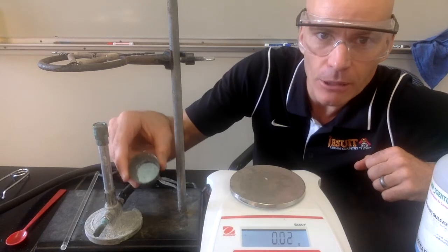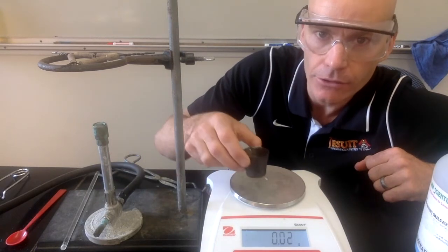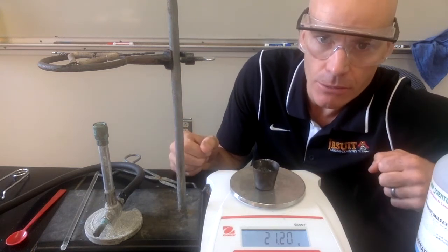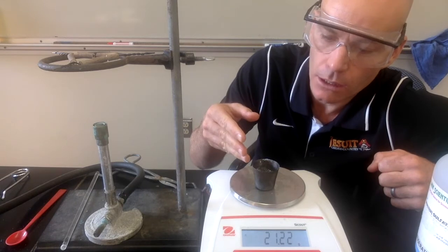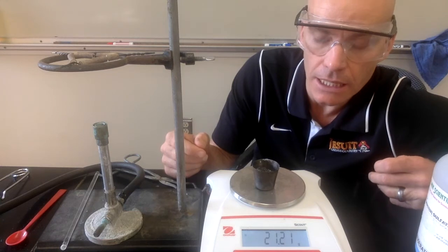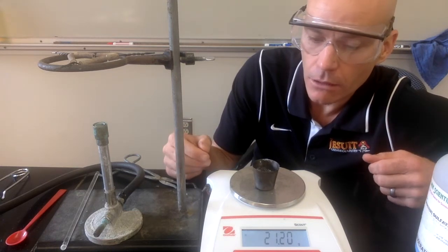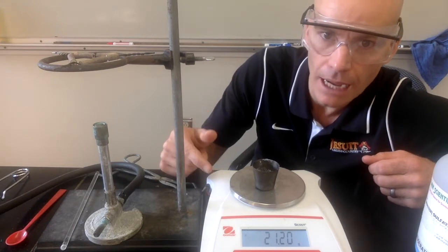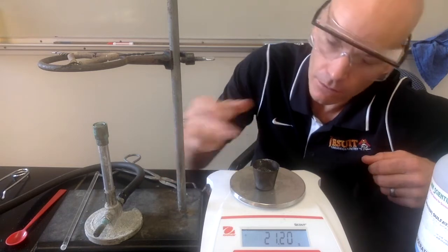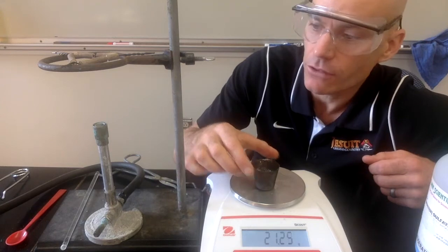Our copper sulfate has been cooling for a few minutes. It's now cool enough to touch, so I can set it on the balance to find our final mass. This is the mass after heating, so all the water has been evaporated out. We're actually going to heat it a second time to confirm that all the water has been removed — if it doesn't continue to get lighter, we know all the water is gone. We'll get the mass of just the copper sulfate and the empty crucible, then heat it again to see if it gets any lighter after a second heating.